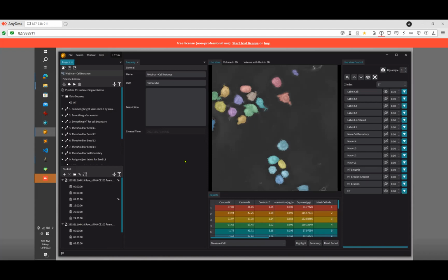The question is about the exported data sets: is there a color or a number mentioned, like in the current view, so that if I want to see which cell data row one corresponds to, I have to check with the color, like red or so?